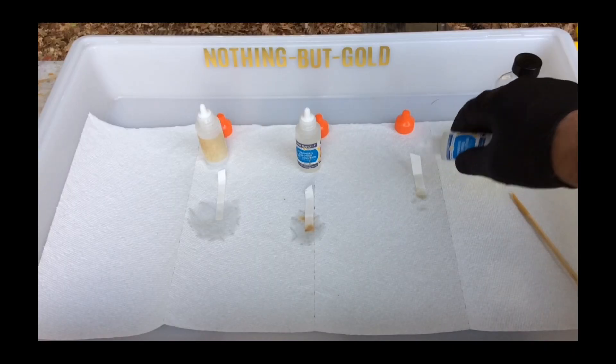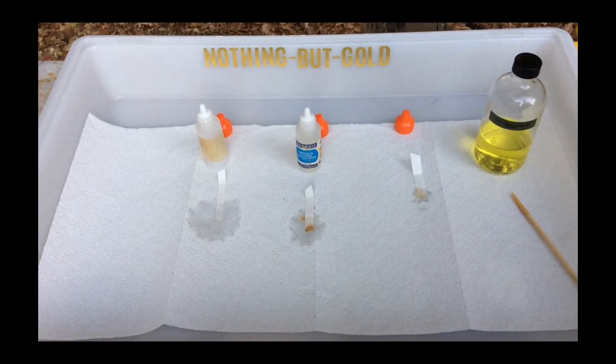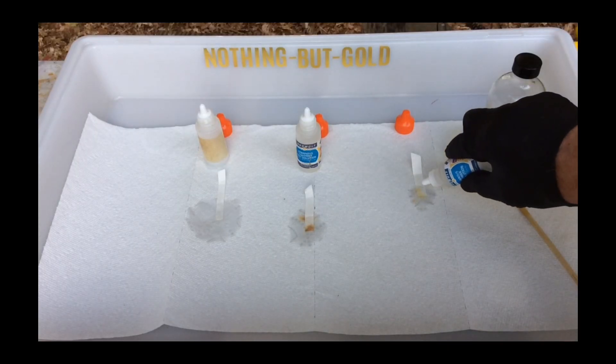The big problem here is that if you don't have valid Stannous Chloride, it will give you a false negative, which may lead you to discard your solution.